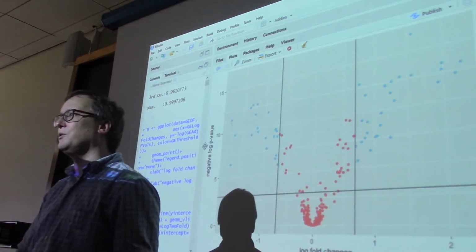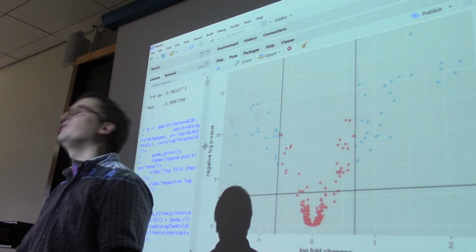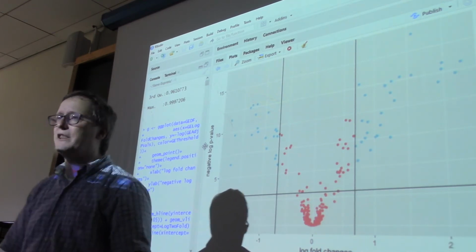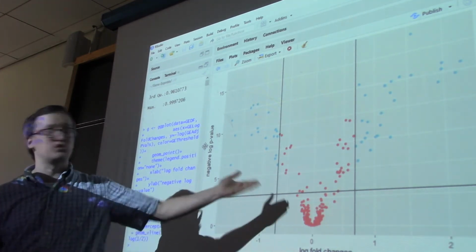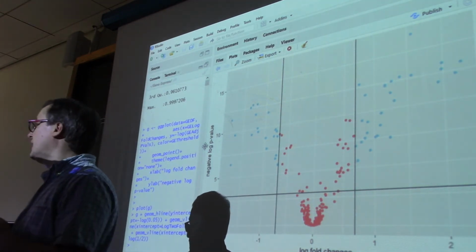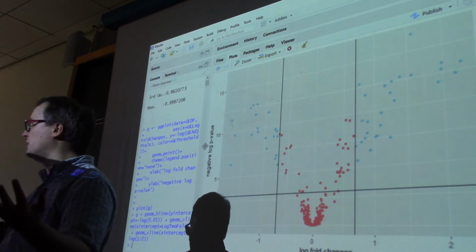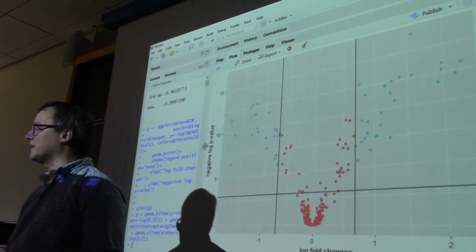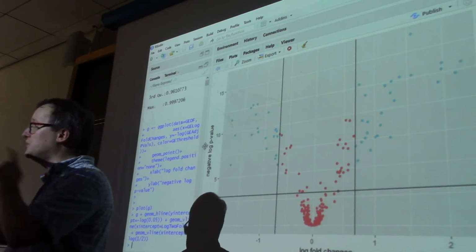You can argue, of course, that if you had the base graphics, the black and white one that we generated a few moments ago, there are very few journals that are going to turn their noses up at such a thing. But color really can help to capture your audience, and Ggplot handles it rather nicely. This is not to say that in base graphics we are prevented from specifying that the dots should be red or the dots should be blue. One of the simpler things to do would be to subset the dots and grab out those that passed and specify that those be plotted differently than those that didn't pass. And then you could use colors for each of those and get the same differentiation effect. But in general, if you're going to do a whole lot of customization to your graphics, Ggplot2 is your best friend.